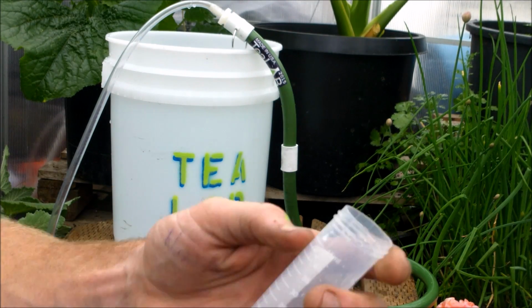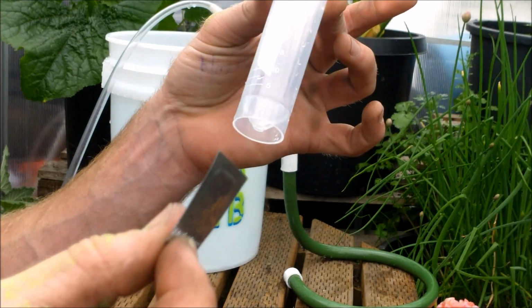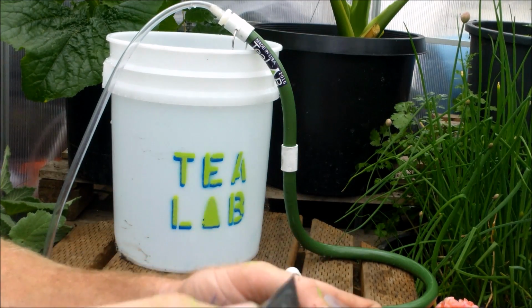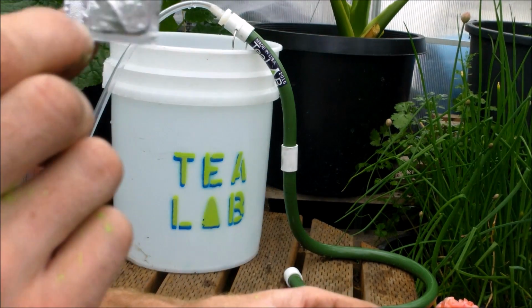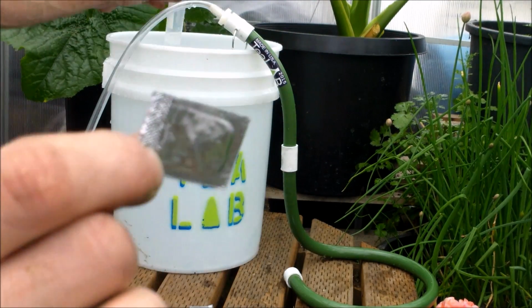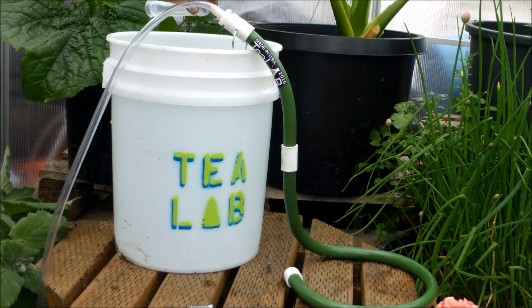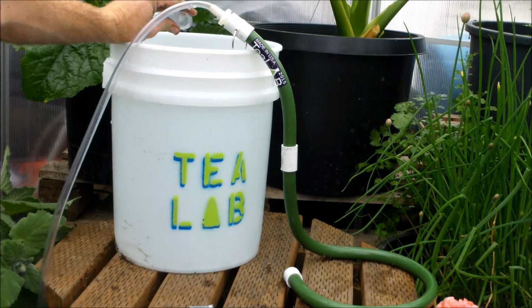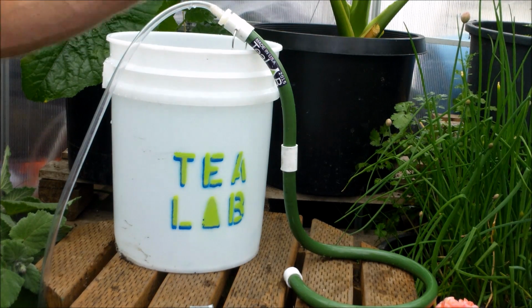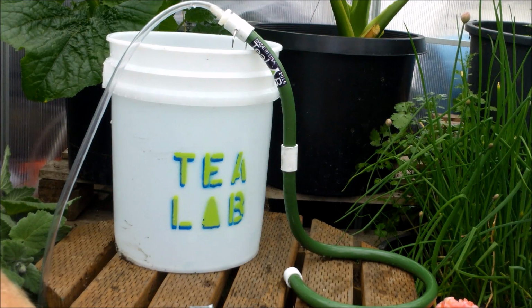I'm going to show you all, or try to answer a question about what it takes to bubble your water and get all the chlorine and chloramines out of there. What I've got here is a chemical called N,N-diethyl-p-phenylenediamine (DPD), and basically it'll change color in the presence of chlorines and chloramines. So this is testing for total chlorine as opposed to free chlorine. Total chlorine is your free chlorine plus your chloramines. Chloramines are basically hypochlorous or hypochlorite ions attached to an organic nitrogen.